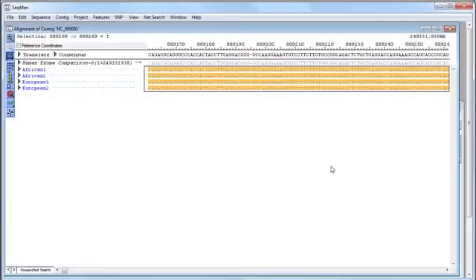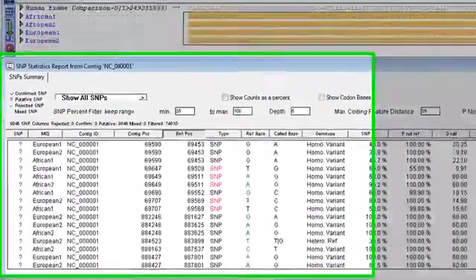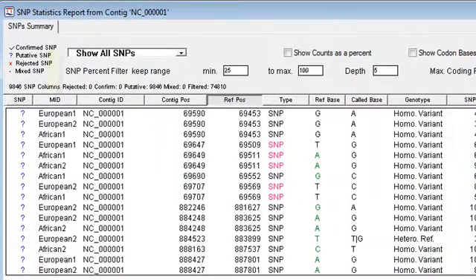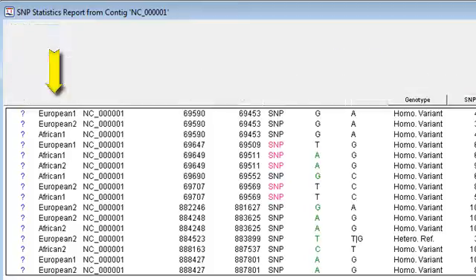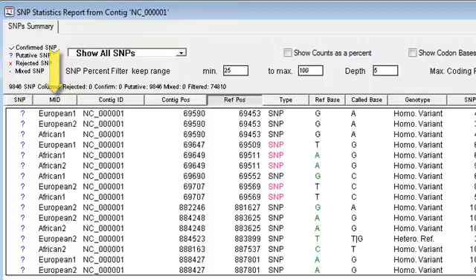To begin SNP analysis, I'll open the SNP report, and you'll see here a column called MID, and this matches the tags or custom names that I set up in SeekMan Engine before I assembled my data. And so this allows me to see which sample contains the SNP.